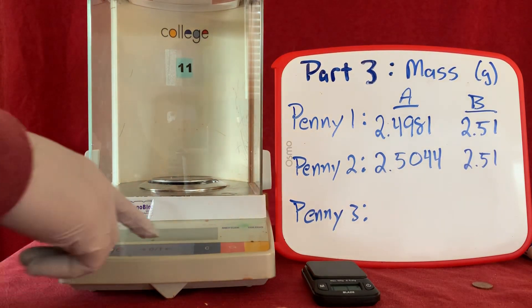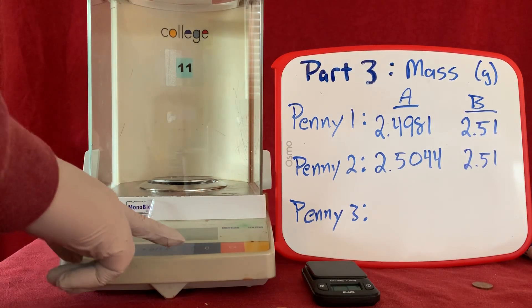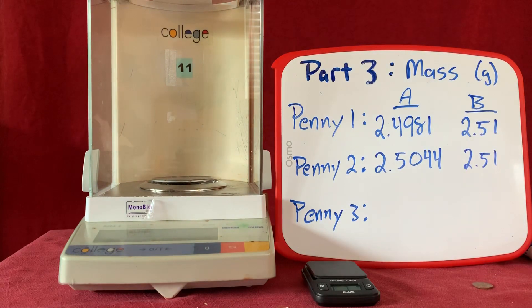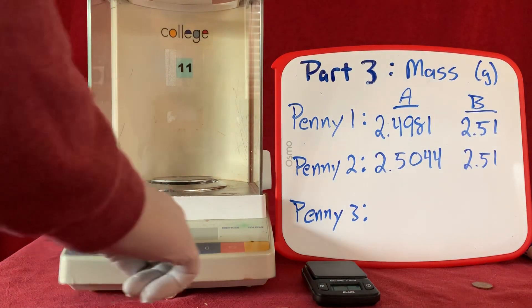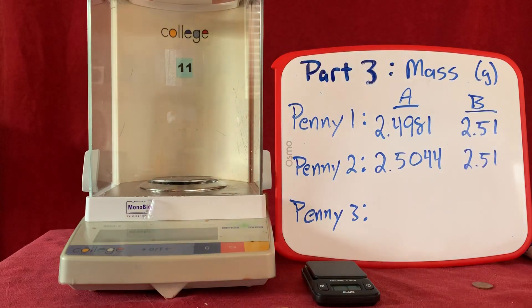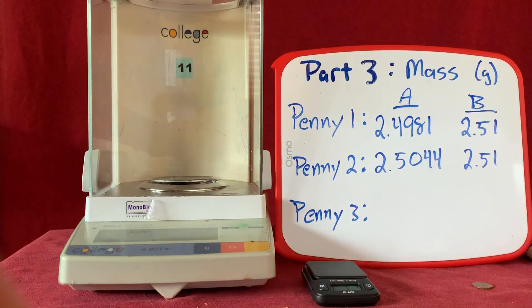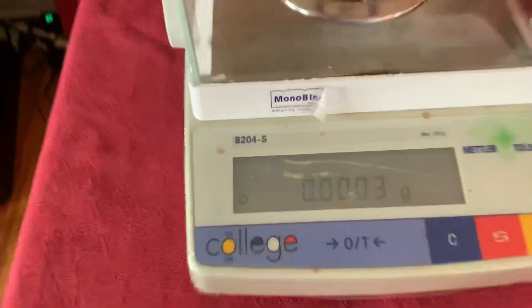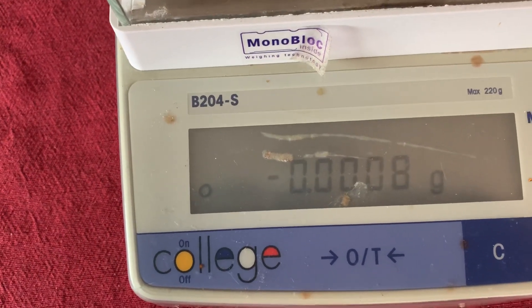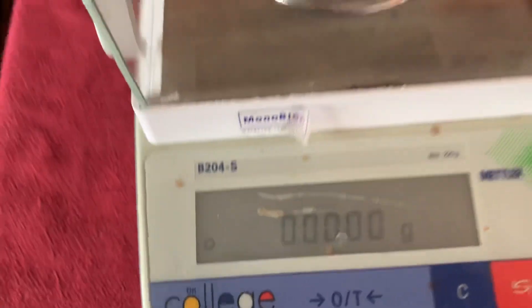And we're going to first tare the balance. We're going to hit the tare, or in this case the zero/T button, and make sure that it resets to zero. I'm going to tell you that it says zero right now. I'm going to show you the measurement. It is reset to zero.